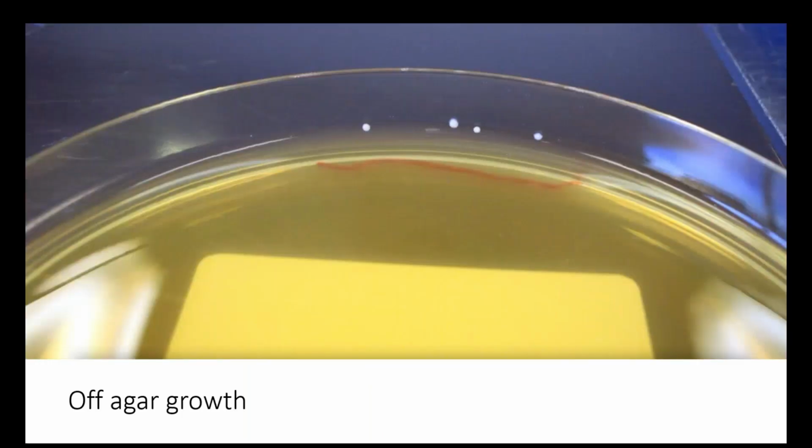Here we have what is some apparent growth off agar, which is rare, but again, can sometimes occur if there's a thin layer of agar on the edge of the plate. So that can cause problems as well. So there are issues with actual microorganisms and the way they grow.